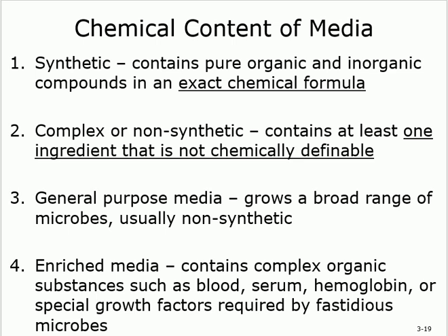And you use that like, here is a patient that's in critical condition and I need, like, half an hour and you tell me exactly what it is. You cannot wait for the other media, right? The other media you can wait hours and days, right? You don't have that leverage. If you need to grow it really fast, what should you do? Enriched media. Okay, this contains the organic substances basically.